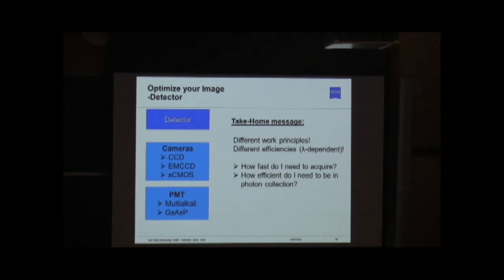The information that I will pass on to you in the next couple of slides will also help you to answer the question of which kind of system you should use, depending on the speed, and depending on the need to be efficient, collecting a certain amount of photons in case you have a very good signal.